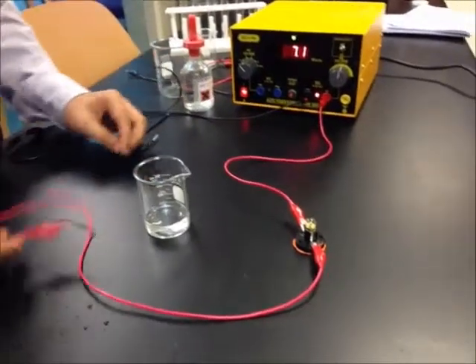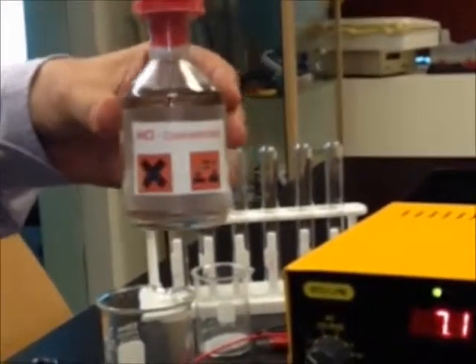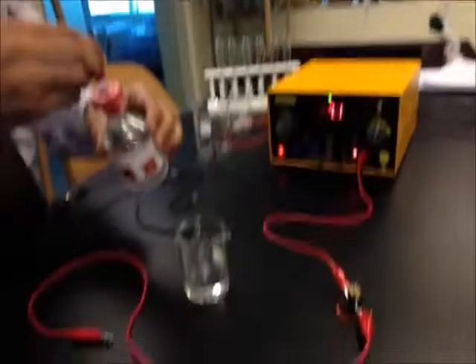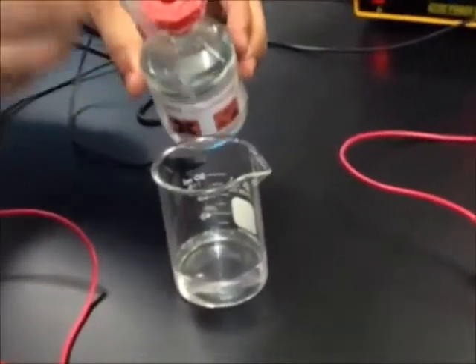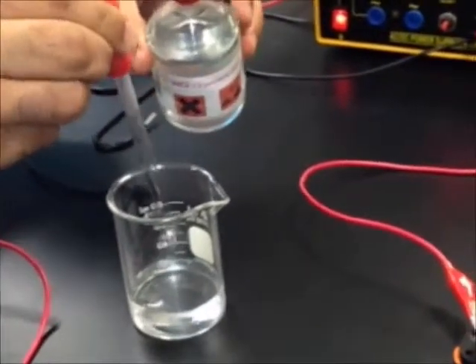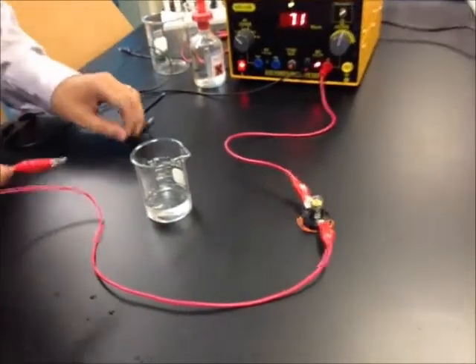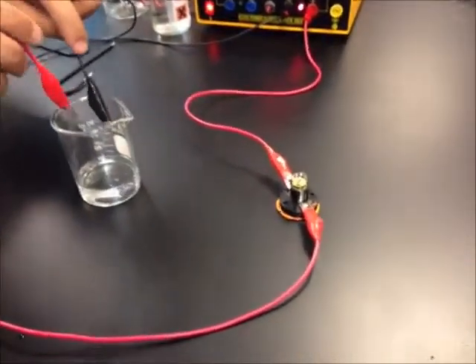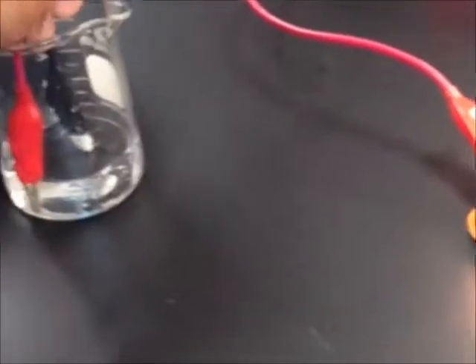Now I'm going to add some concentrated HCl, hydrochloric acid, and I'm going to check again if it conducts electricity or not. As you can see, the bulb is on.